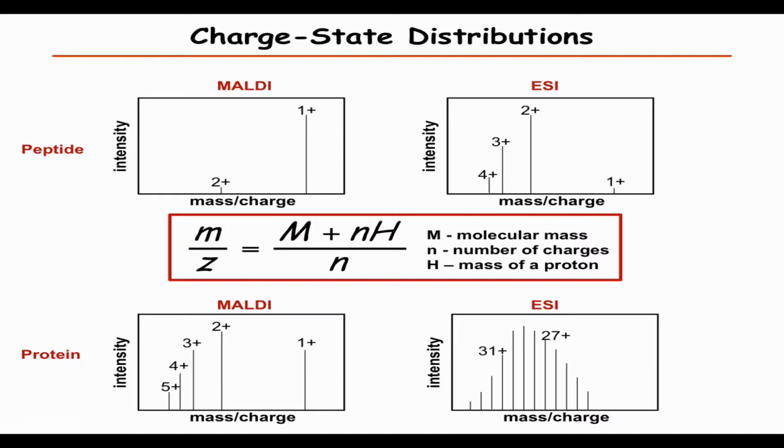And then what happens is that they explode. In this explosion, they drag with them the peptides and proteins that are embedded in the crystal and throw them out into the gas phase. In this process, you get some neutral molecules, some of them charged. It's complicated, of course, this explosion, but in this process, you get some charges attaching.